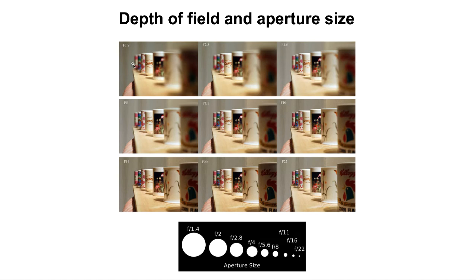So this is a picture of mug cups on the table. If you have a large aperture, you get light mostly focused on somewhere in the space. But if you use a smaller aperture like this one, everything in the field is in focus, although you have to expose for a bit longer. Because everything is in focus, you cannot reject the light coming from unfocused planes in TEM.